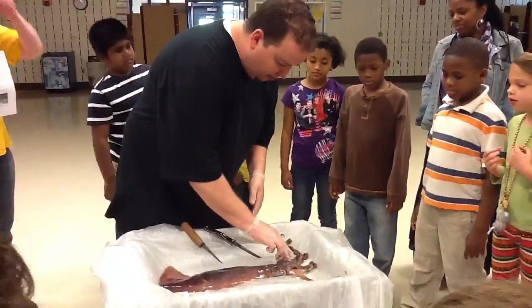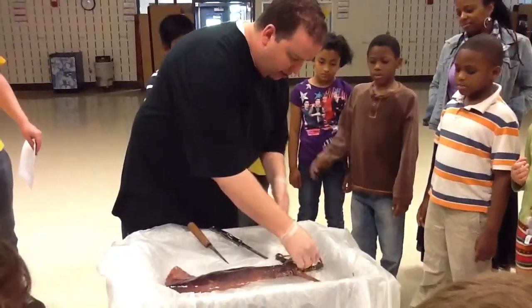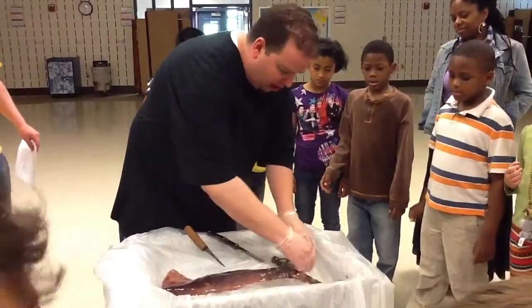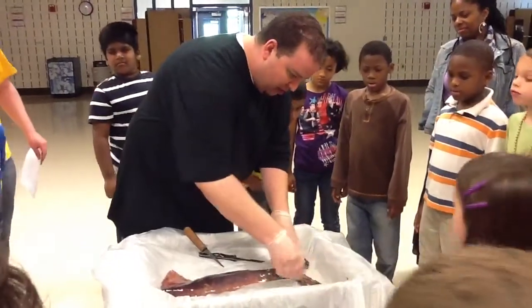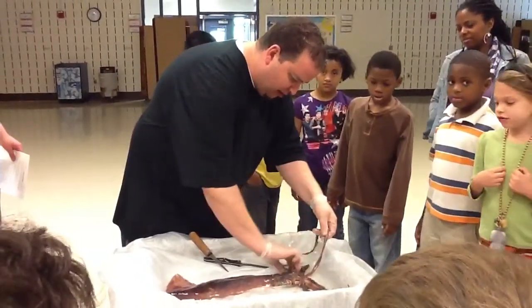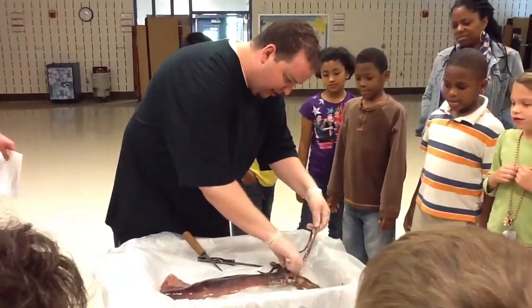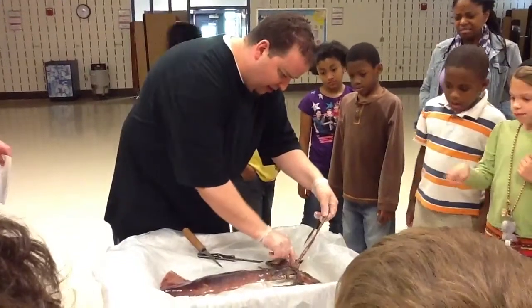Now this guy doesn't have really big sucker claws on him like some of the ones we saw in the video. But you can see — one, two, three — that's one of the long ones — four, five, six, seven, eight.